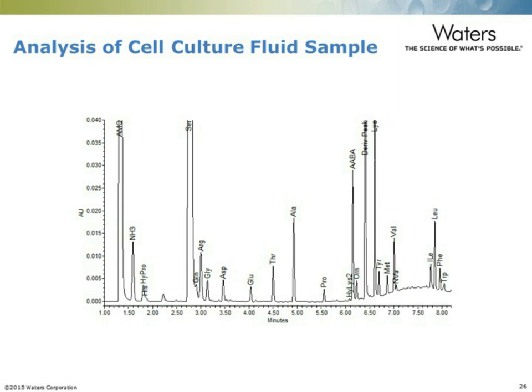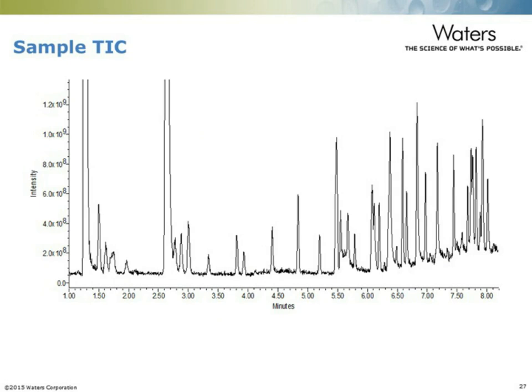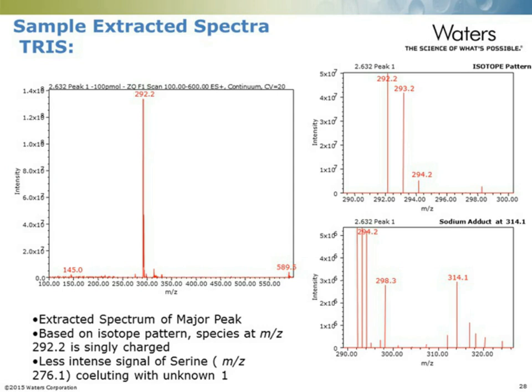When we looked at this using the MS, we could see all the same peaks, but we still had the large signal for the peak at the retention time of serine. When we looked at the spectrum of that peak, however, the extracted spectrum of the large peak in the sample corresponded to the molecular weight expected for tris.